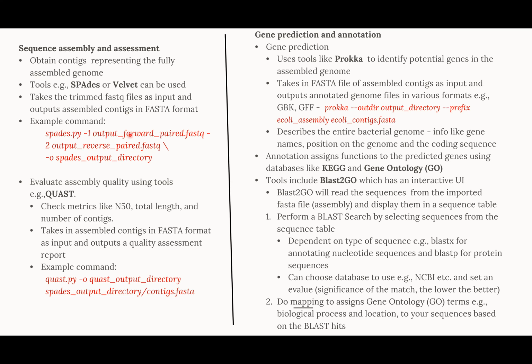So the command that you run here would be this. You have to put your forward reads and then your reverse as well, just like in the Trimmomatic command. And then you have to specify where it should put the output files.